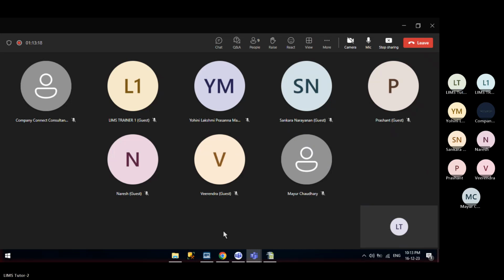Today LIMS is live and all the materials are covered. It is integrated with SAP and with most of the instruments in the laboratory, and not just at one but at 7 of its locations across India. We will share that experience, and it will definitely help you in the implementation process. Okay, thanks.